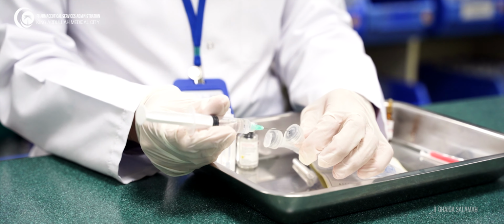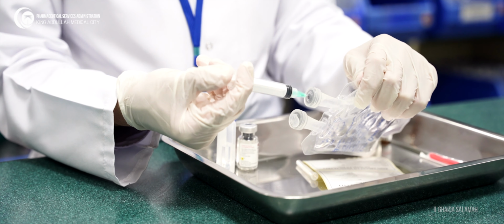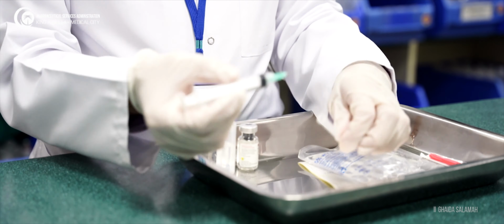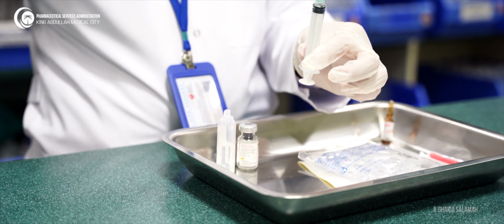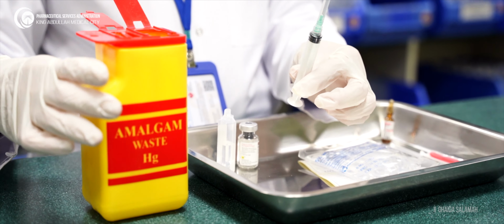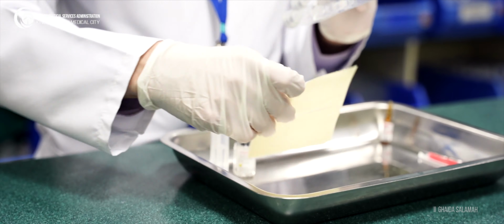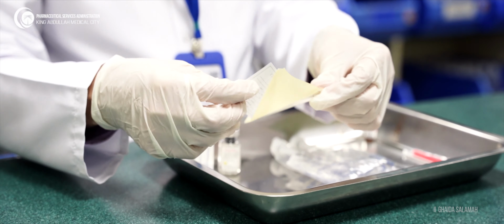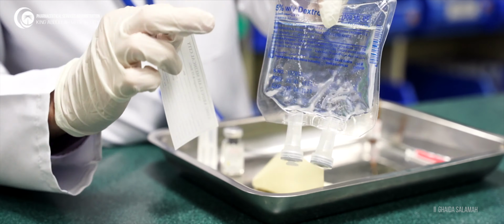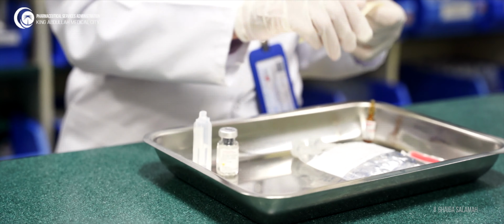Then transfer the liquid to the injection port of the bag. Then cap using the scoop method. If you have a sharps container, you should discard the sharps in the sharps container. Then you will stick the label with all information on the bag.